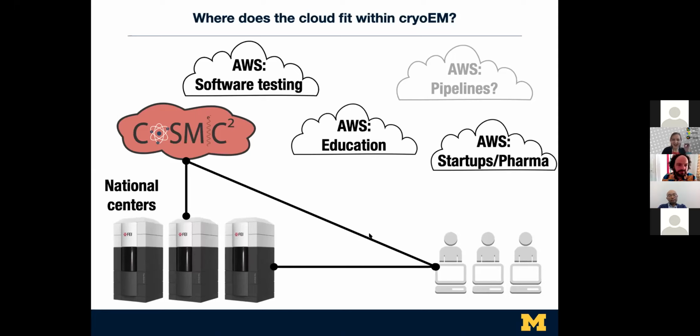There's a question about whether your AMI is publicly available. Yes, if you go to cryoemtools.cloud, you'll get this information. Or if you search cryoEM in the AMI search for people who've done this on Amazon, you'll see it come up. Everything is freely available. I'm not maintaining all of them to be bleeding edge as far as versions, so there might be some updates required.